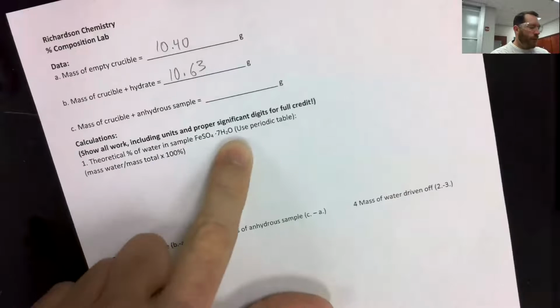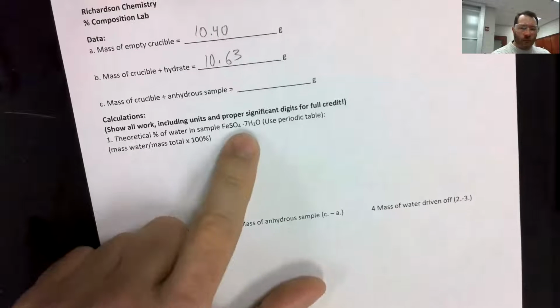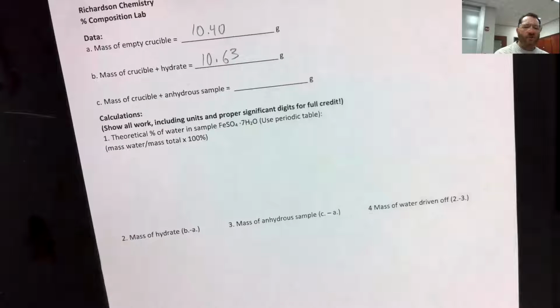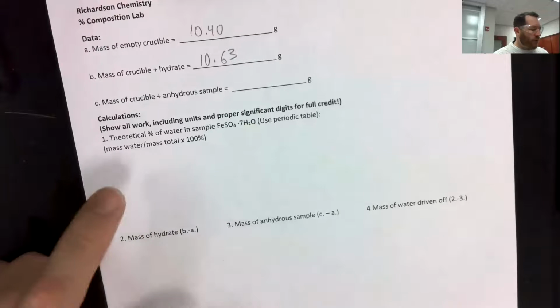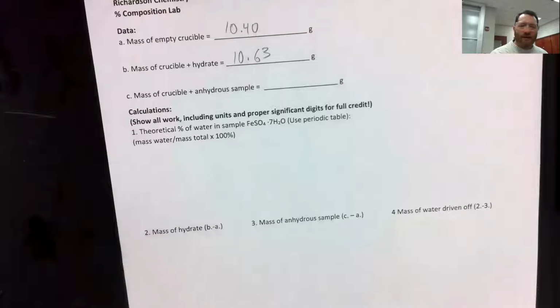So that'll be the total mass on the bottom. And on the top part, you want to add up your 7 waters, so 14 H's and 7 oxygens on top. That number will be your theoretical mass, and we'll see in a little bit how close our theoretical mass is to the actual mass. But again, I'm going to leave you here for a few minutes. I'm going to let this do its thing with that water.